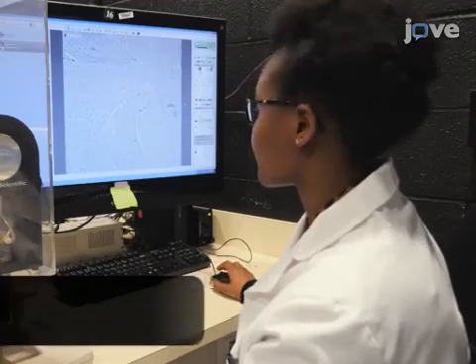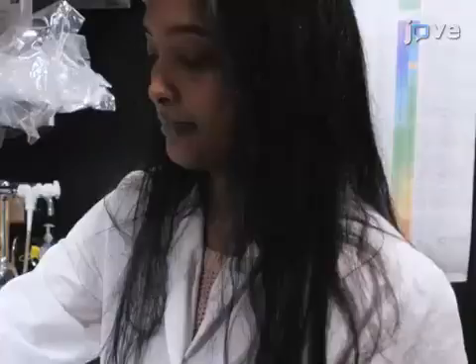The main advantage of this technique is that it allows direct imaging of DNA lesions introduced by the laser-activated compound in genomic DNA. This has not been possible before. Demonstrating the procedure will be Durga Gichimu and Gali from our lab.